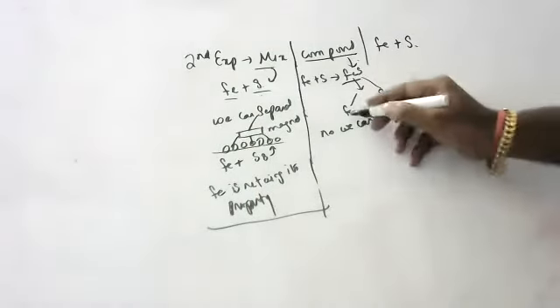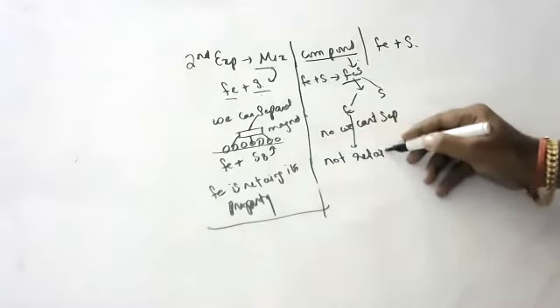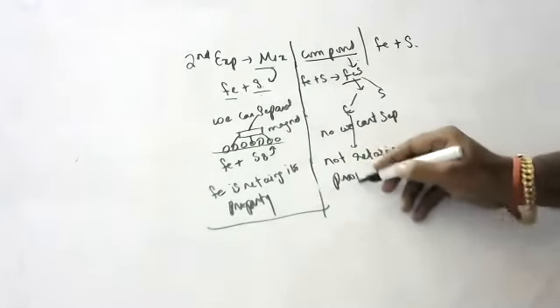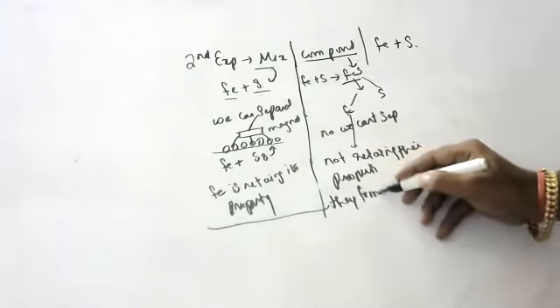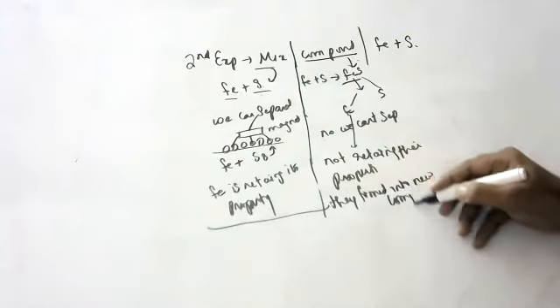But in iron sulphide, the iron atoms are not retaining their properties. Why are they not retaining their properties? Sir, because they are mixed well, they formed a new compound.